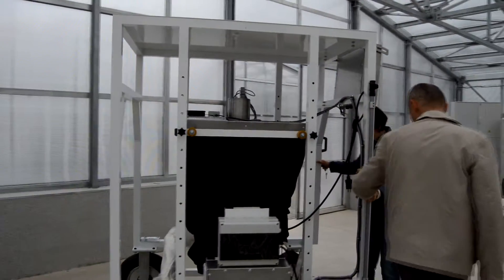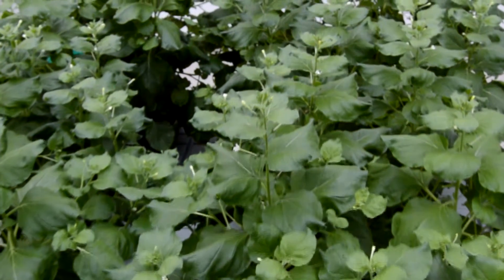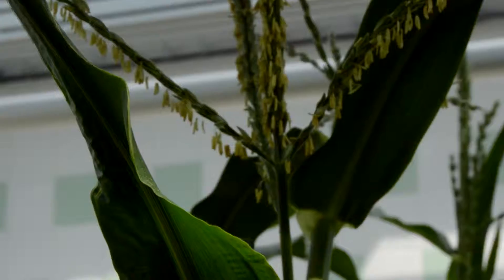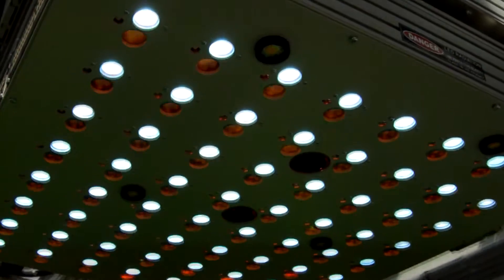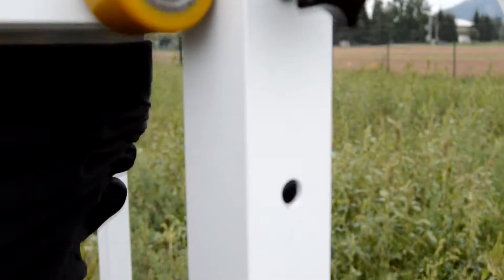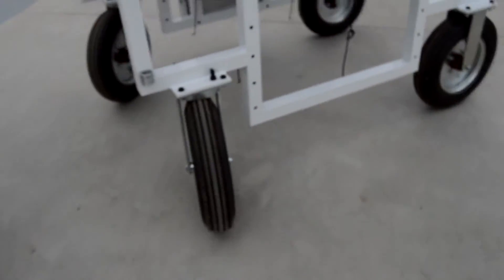The Rover Fluorocam is specially designed for monitoring plants in the greenhouse and the field. It is suitable for non-invasive and in-situ analysis of large plants such as mature corn or soybean, and is designed for scanning an area of 35 centimetres by 35 centimetres with height adjustment from 20 centimetres to 1.5 metres. Its large wheels allow for easy movement in the field.